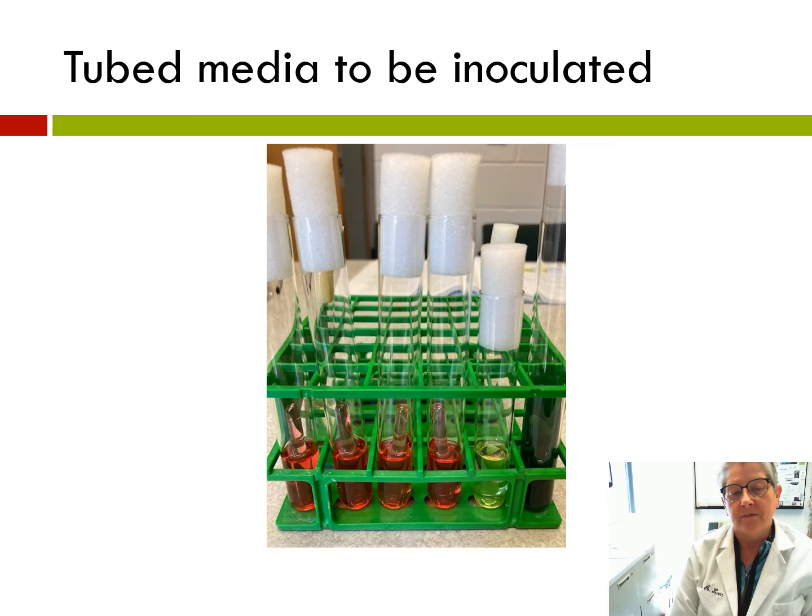Right now, those tubes are filled with the phenol red broth base, but as we inoculate the bacteria into those tubes, they may or may not turn the media yellow if it produces acid from fermentation. And if it produces CO2 gas, that gas will be collected in those little inner tubes, and we will see the media being displaced, and you'll just see a clear area in the tubes. And again, you'll have pictures of the results of your bacteria next week.